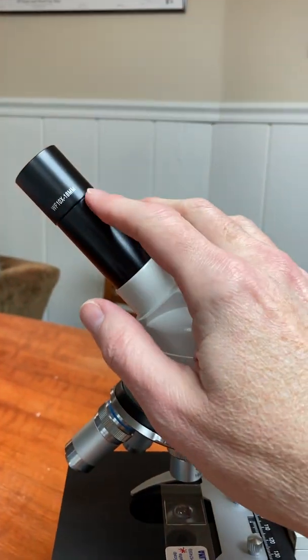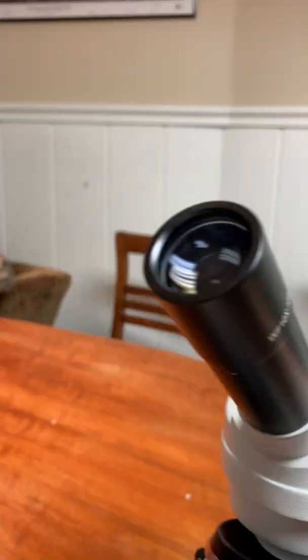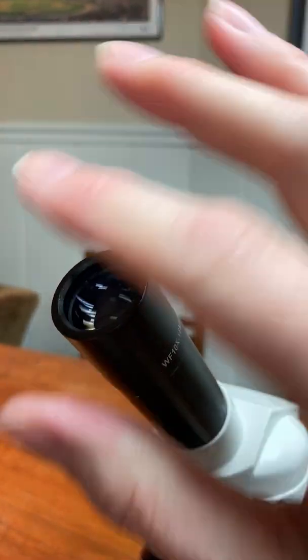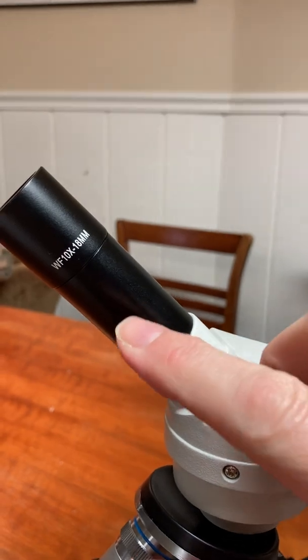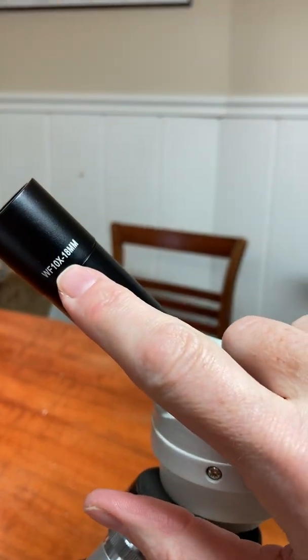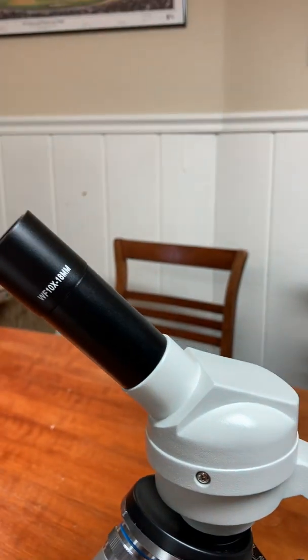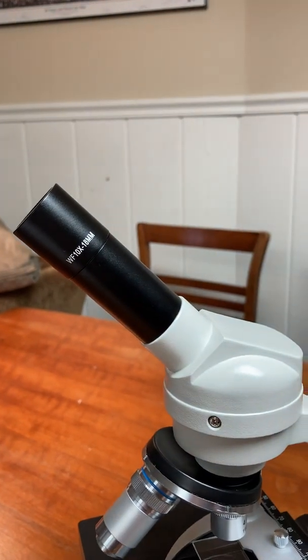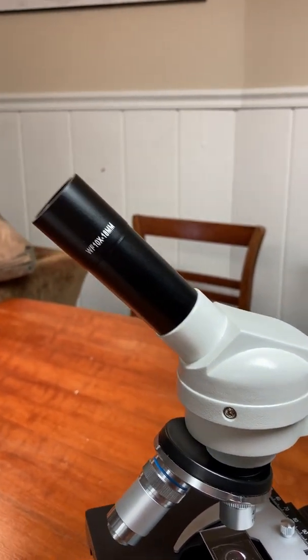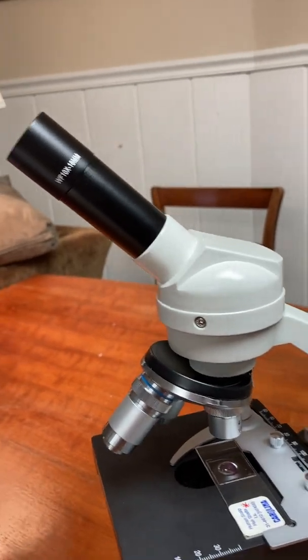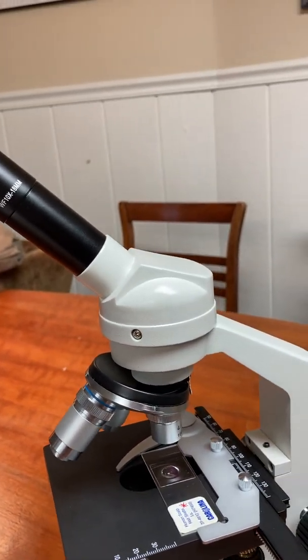This is the ocular lens. And ocular means eye and it's the lens that you put your eye up against. Notice that it has writing on it right there. And the important letters are 10x. That means that this microscope lens has a power of 10, a magnification power of 10. It magnifies the specimen 10 times. X is times.